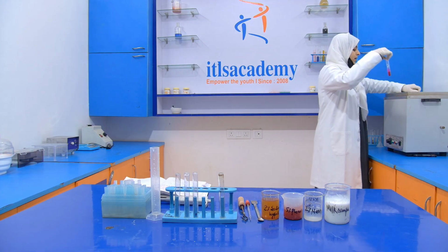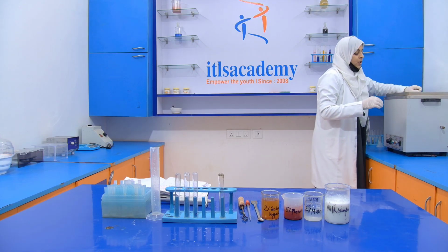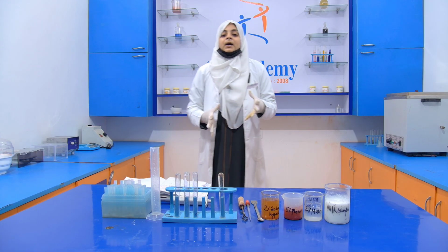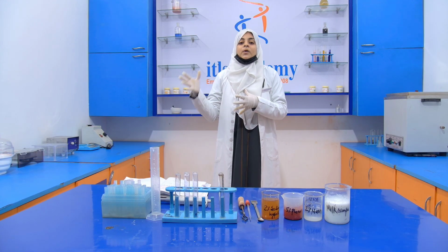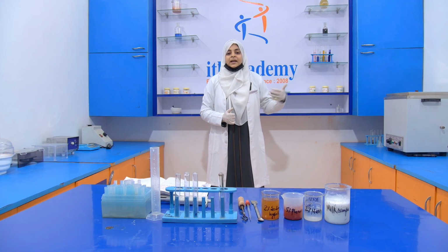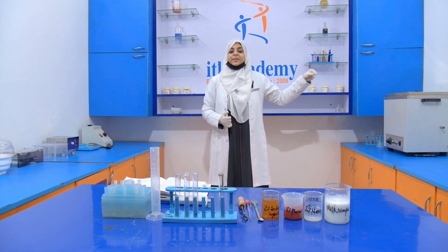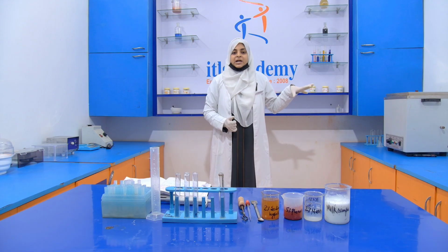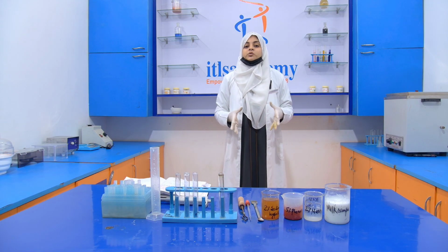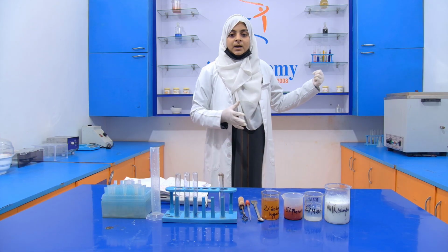Now I am going to keep it inside the water bath for 20 seconds. The deep blue color that we get if the ammonium salt is present persists for 12 hours. So we have to check it after 20 seconds by taking the test tube out of the water bath. If the pink color persists, and we don't get any bluish, deep blue color, then it means that our sample does not contain any ammonium salt. Our sample is pure. So we are going to take it out from the water bath.